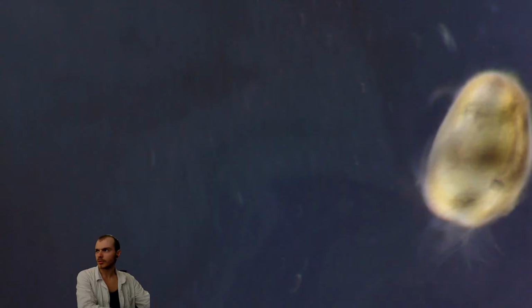Some of them are pretty big. It is full of bacteria. I think all those dots are bacteria, so it has a lot of sources to eat. The ostracods have a lot of options, but I'm not sure if they eat a lot of alive bacteria.